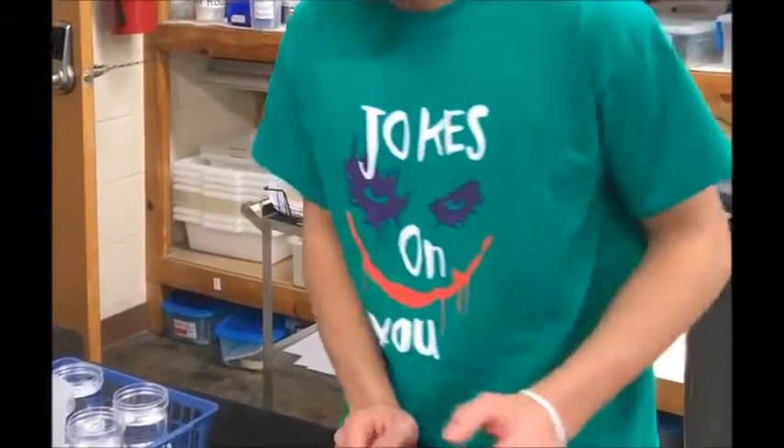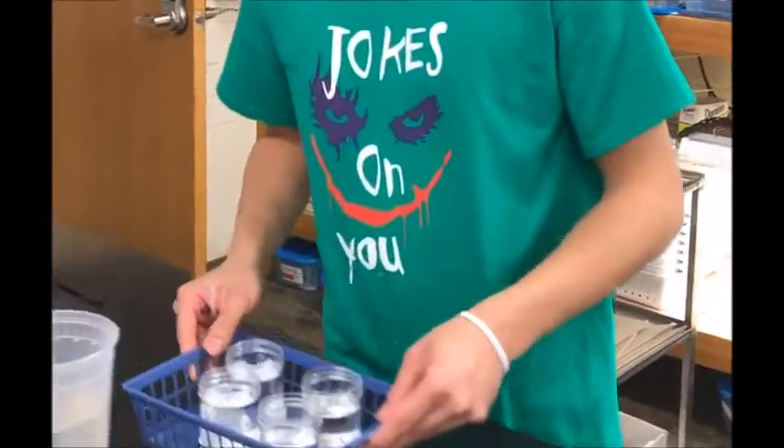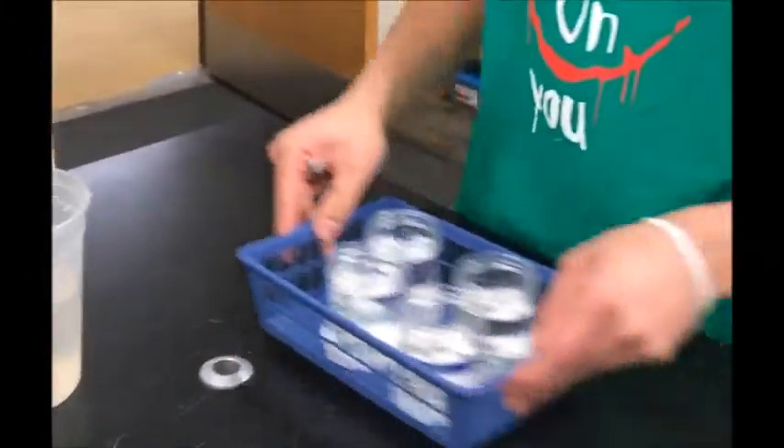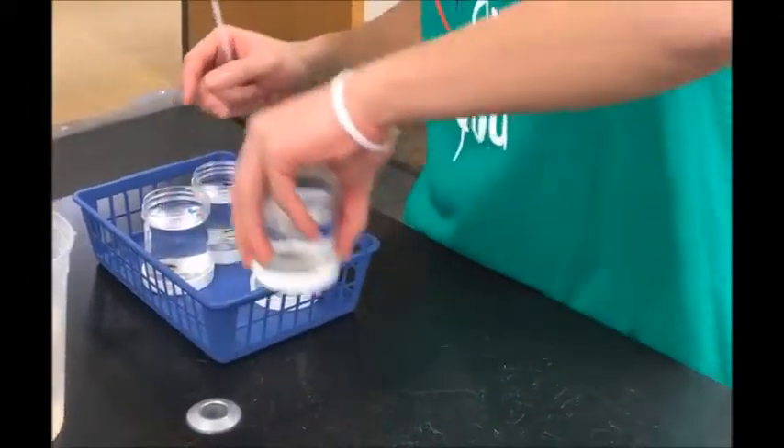Hi, my name is Zach and today I will be feeding Planaria. What I have here is Planaria cultures and two Lumbriculus cultures. What you want to do is simply take out one of the Planaria cultures.